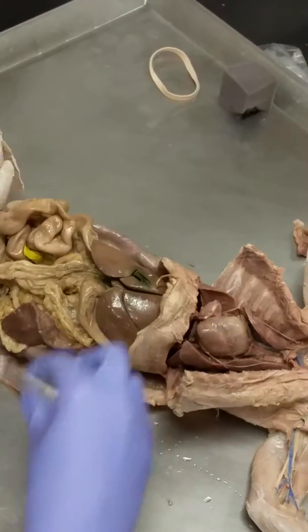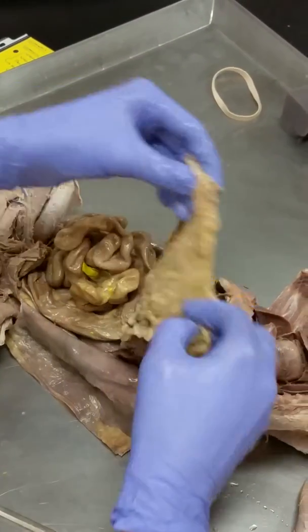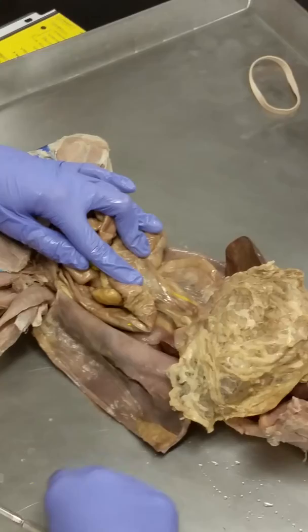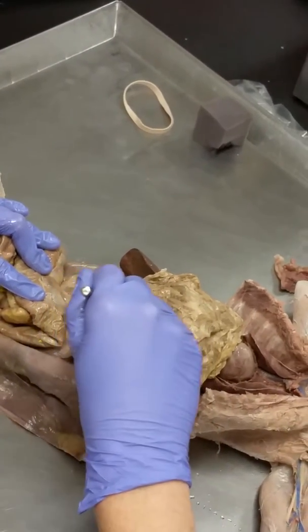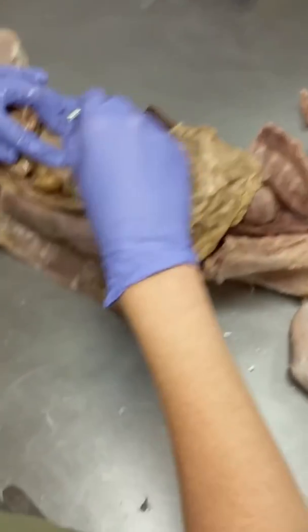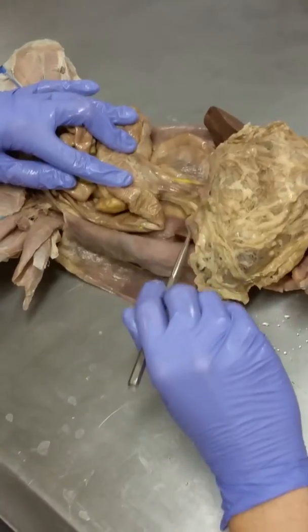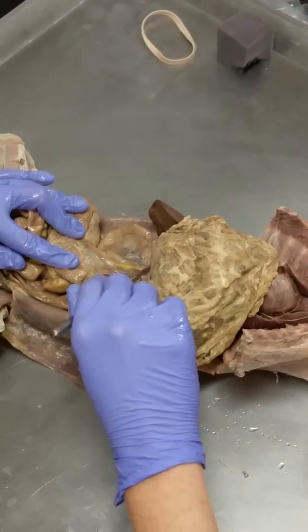To see the pancreas, what you want to do is take your greater omentum and fold it up, and then look against your duodenum. I'll turn them around so you can see it too. You see this piece, this thing here? I think it looks kind of like carne asada, except it's wider, obviously. That's pancreas. So pancreas is running underneath of this greater omentum here, and then along the duodenum.